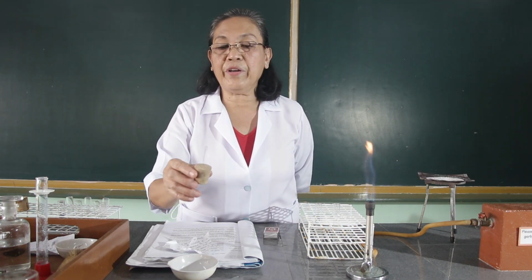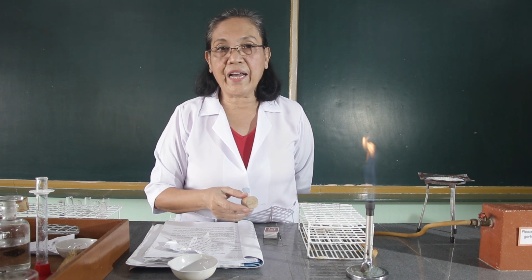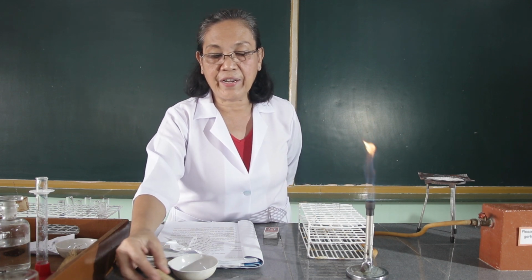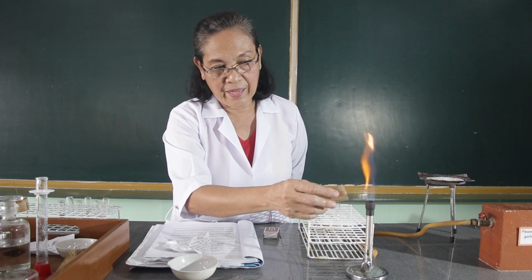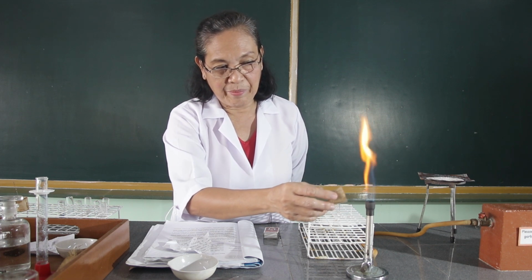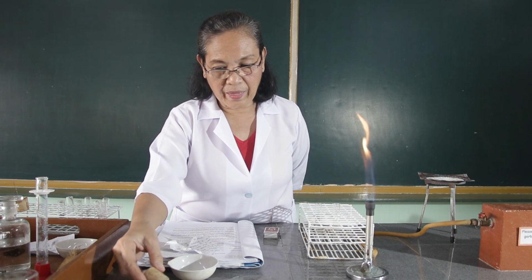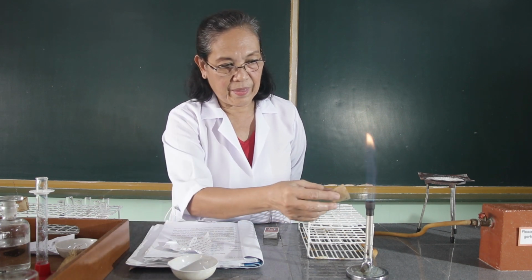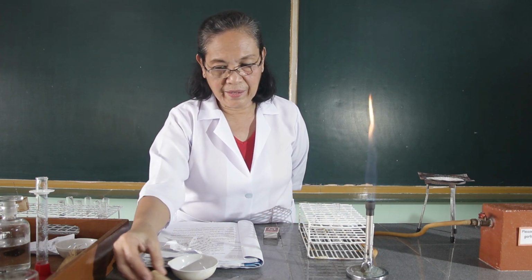Now, again, we're going to clean the nichrome wire for the next ion to be analyzed, which is ammonium. So, dip it again in the hydrochloric acid, then bring it to the flame. So, it seems there is still the presence of potassium. A little bit.